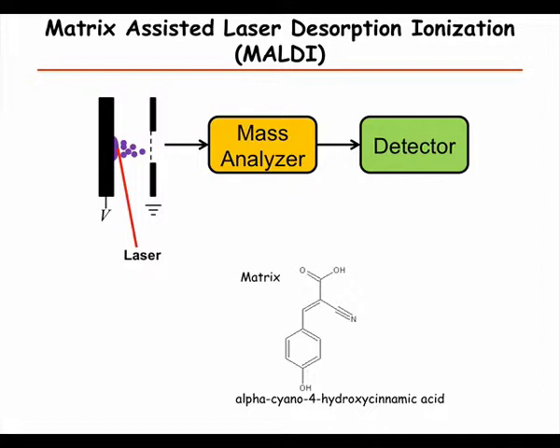So the other technique, both electrospray and matrix-assisted laser desorption ionization, was developed in the late 80s, about the same time they came out. So MALDI: here you have your sample on a solid surface.